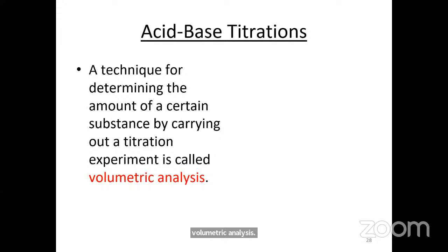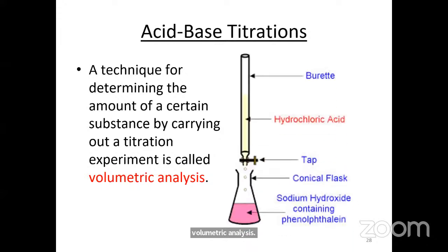So, as we can see, this is the setup for a titration experiment. Titration is one of the interesting experiments any student would like to do. Maybe because we normally have colors, and people like colors.